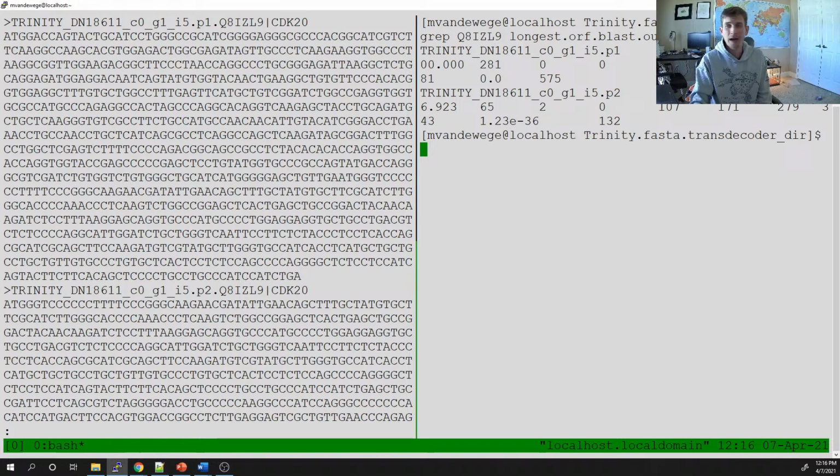But I've amended it so I get rid of human. There is a reason for this, because I want to see the number of unique genes. What's going to happen some of the time is the best hit won't be from a human gene. It's just a property of BLAST. It's a property of working with transcriptomes, because we're not actually working with the exact sequences of what we would find in the genome. It's often called a gene model. It's very, very close, but it's not perfect, and we can't right now validate that it is indeed perfect. But it is certainly better than nothing, and it's pretty close.